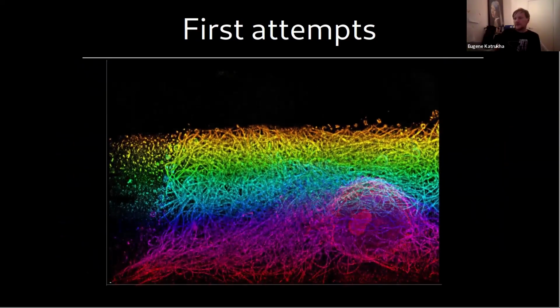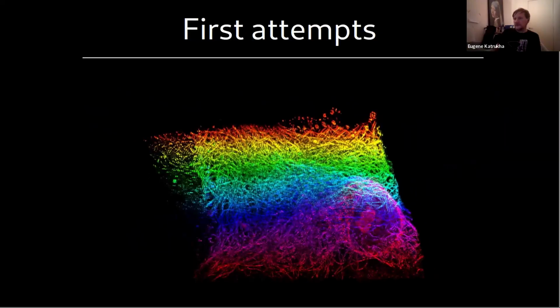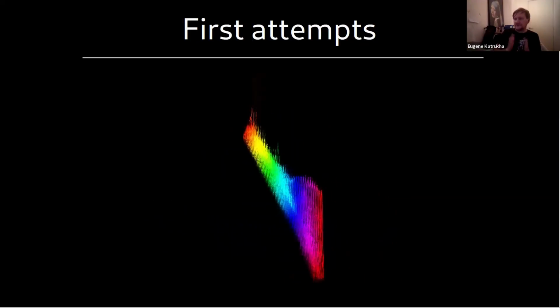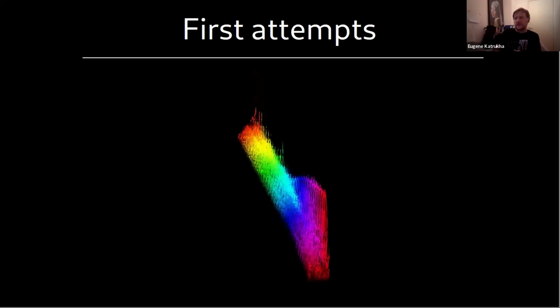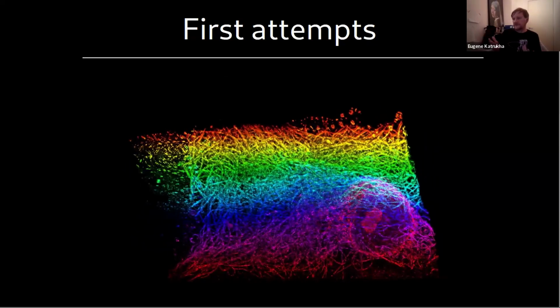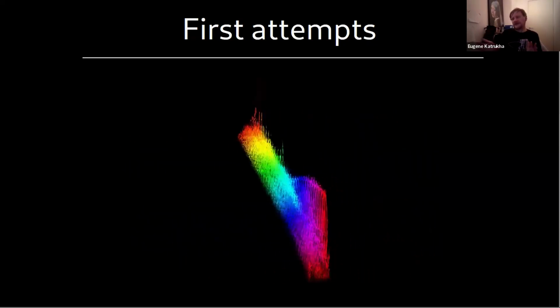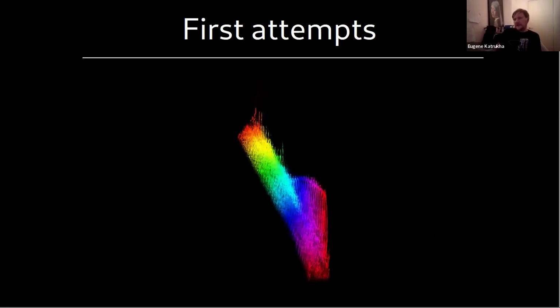So we were really happy with it, but there was only one single problem: each of the frames that we acquired was basically a single slice, right? So it was really a 2D picture. So in each individual plot, if you look at a very nice angle, it looks really nice. But as soon as you start to look from the back, you see that it's not really 3D data.